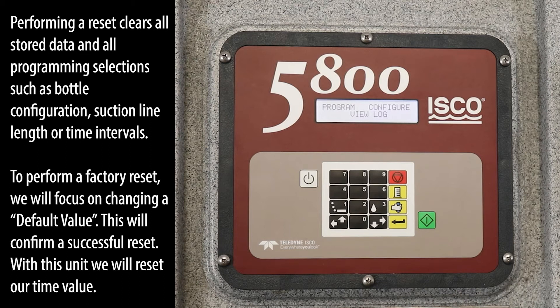Performing a reset clears all stored data and all programming selections such as bottle configuration, suction line length, or time intervals.